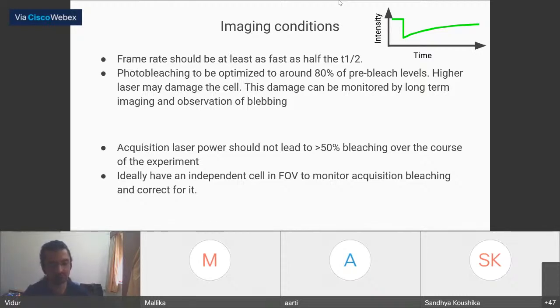And we show movies where you can see events where a mitochondria will give some contribution to a stationary mitochondria and yet continue ahead. So there will be recovery in the time scale of a movie, and that example is there. But the other things all hold what Vidur said, but there is this one or two cases where you can look at what the contribution is if the objects are discrete and far apart.